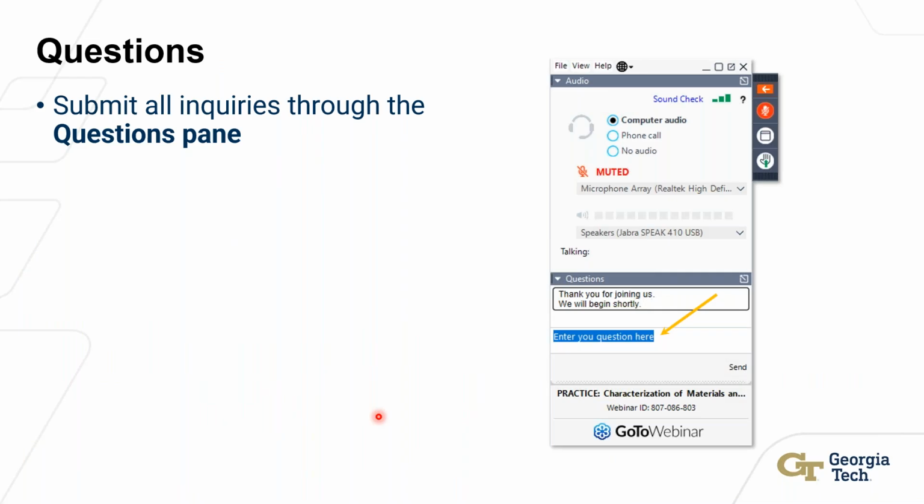If there are multiple grains that are diffracting essentially the same amount, the algorithm's going to have a difficult time picking out one individual diffraction pattern from that set. So you're probably just going to get very low reliability indexes. Yeah, there are definitely opportunities for algorithm development there to deconvolve diffraction patterns, but that would take significant algorithm development. Yeah, sure. Okay.